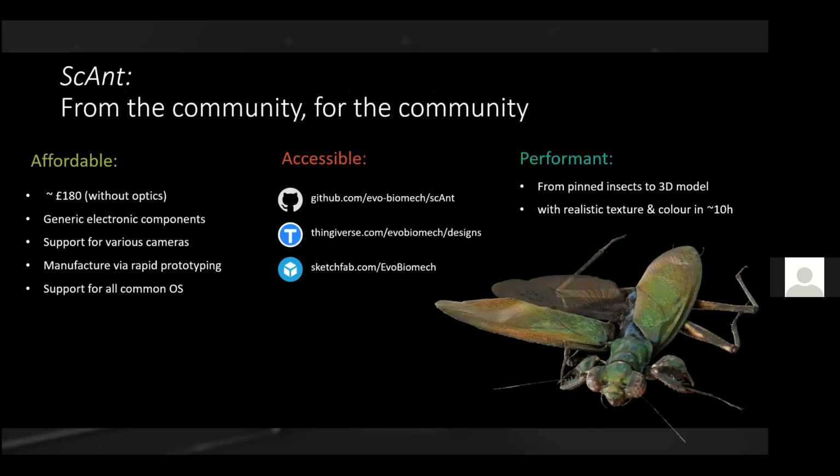Okay, so that's roughly what I wanted to say briefly on scAnt. We think it's affordable, accessible, and performant. It's relatively cheap. It uses generic electronic components. It has support for a large number of cameras. Manufacturing relies entirely on rapid prototyping.